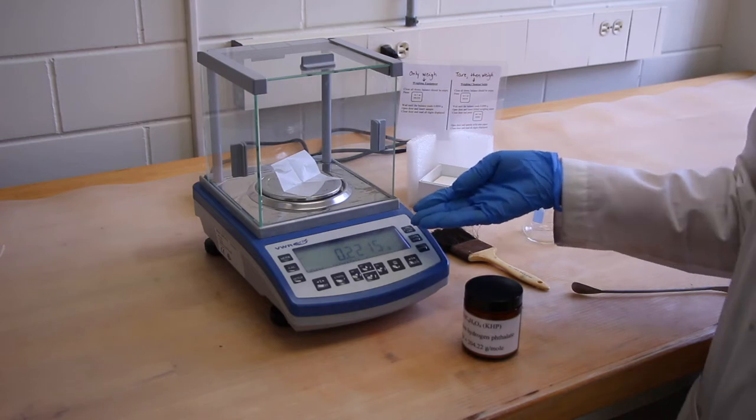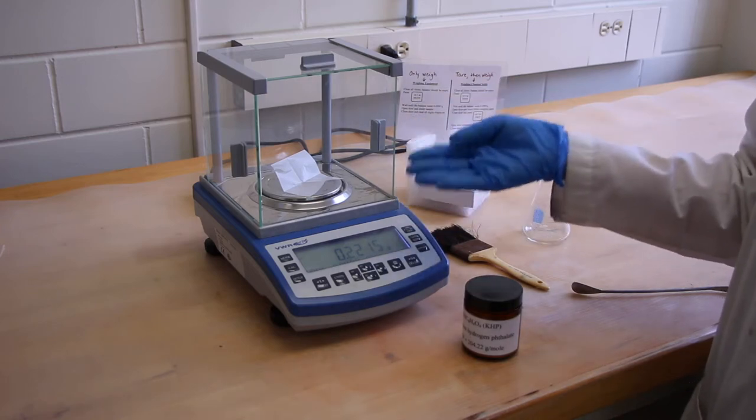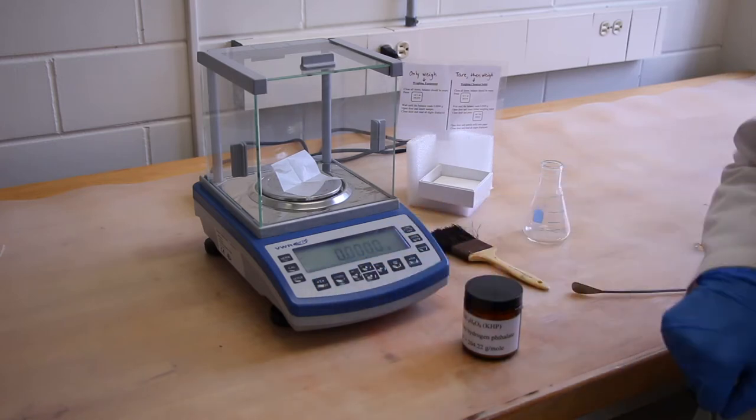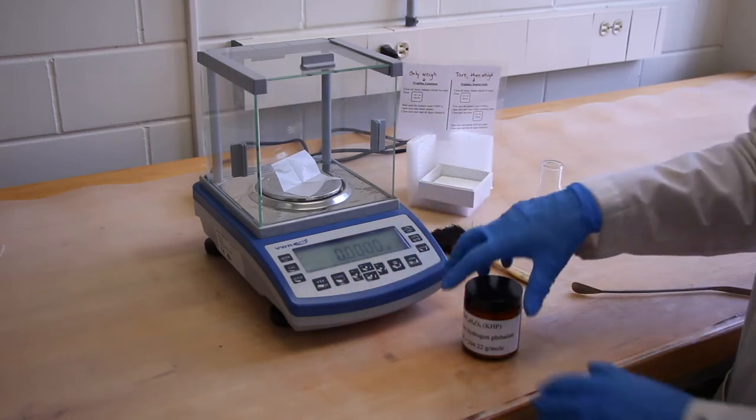And we're going to tare that out, or subtract that value. And so we hit the tare button. And now our scale reads zero.